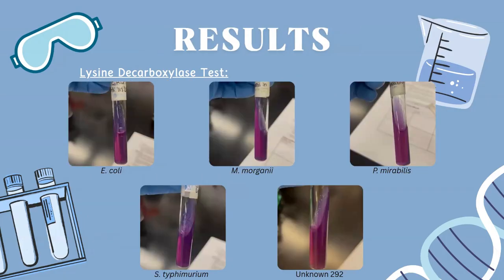These are the results for lysine decarboxylase. What's the purpose of lysine decarboxylase in gram-negative bacteria? They determine whether a bacterium can decarboxylate lysine to cadaverine, which would raise the pH. It helps to differentiate members of the Enterobacteriaceae and other gram-negative rods based on their metabolic capabilities.